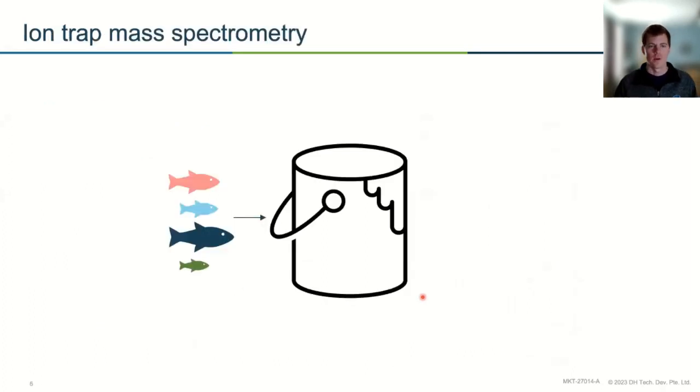So I'm going to first talk about a few of the common mass spec types, and as I said before, we're starting down here at the very basics. So if this is way too much review for you, that's fine. You can multitask, but hopefully this will help some people.